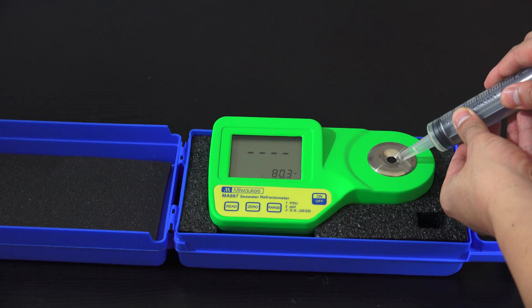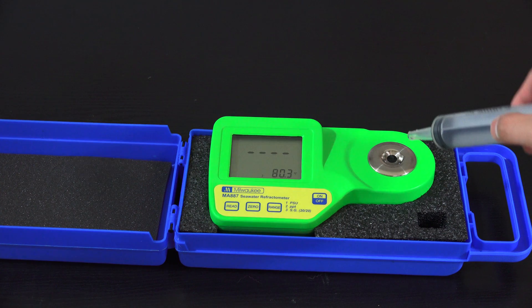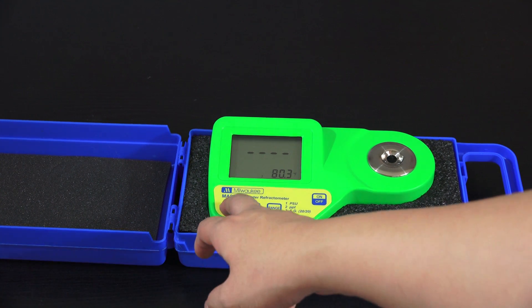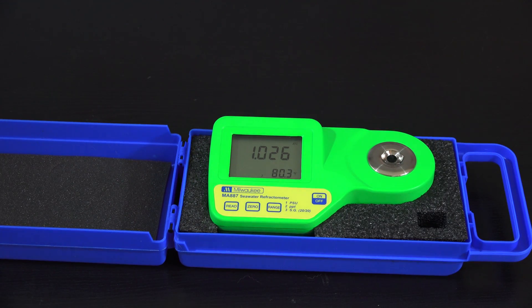I'm going to do a quick test to show you how it works. You grab your solution, put it into the well — the directions say make sure there are no bubbles because it uses lasers to refract — then you hit the read button and it gives you your salinity level. That's pretty much it.